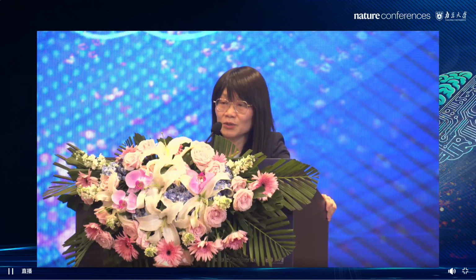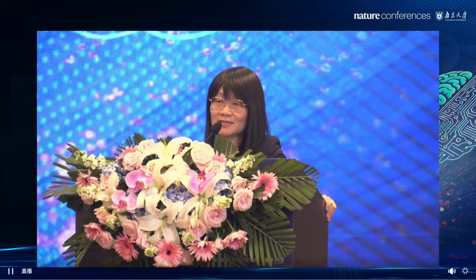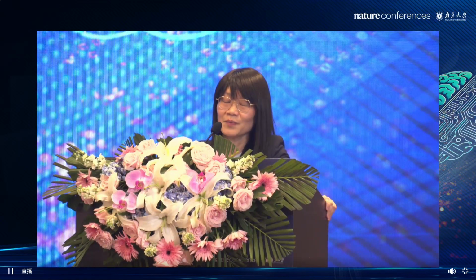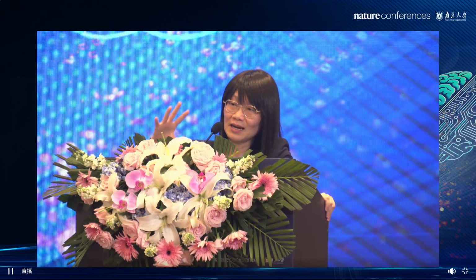For example, Jin Yang from Sydney University has review articles about this 3D reconstruction of spatial omics. The essence of those methods utilizes a method called optimal transport. It involves the optimal alignment of spots across sections in the Z stack.